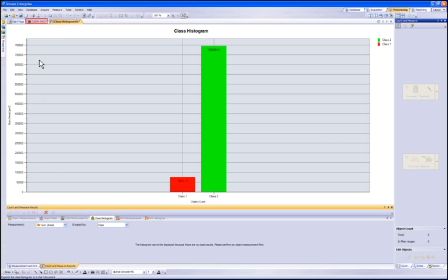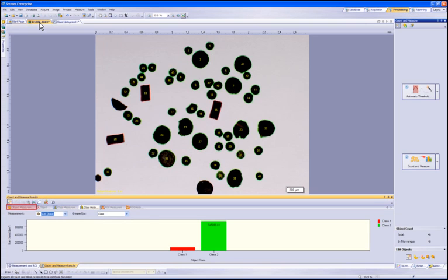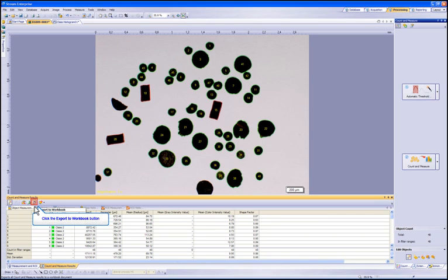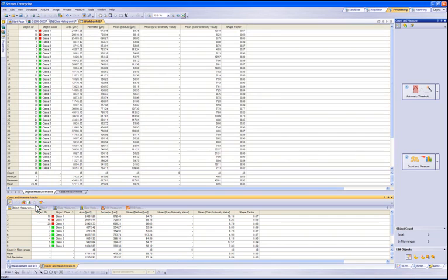This chart can be used in the reporting tool or saved into a database or file location. Let's go back to the image by clicking on it at the top tab. Now you will need to click back on the Object Measurement tab. By selecting the Export Workbook button, the object measurement list will be transferred to a usable workbook within Stream. Now that we have a list in a workbook, we can save it to the database or file location or include it in our report.